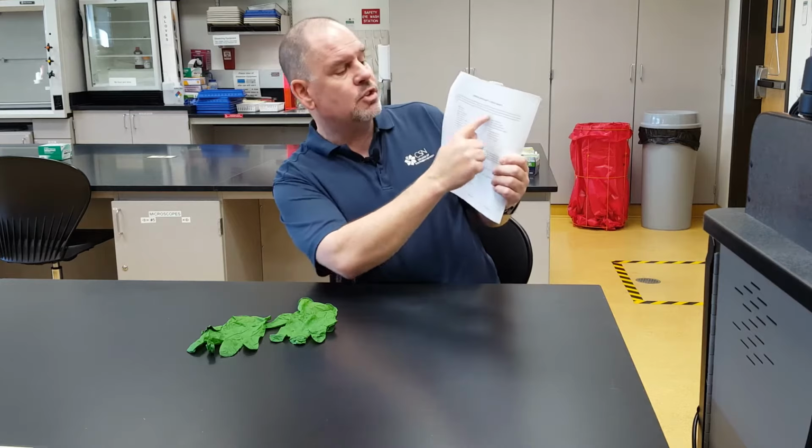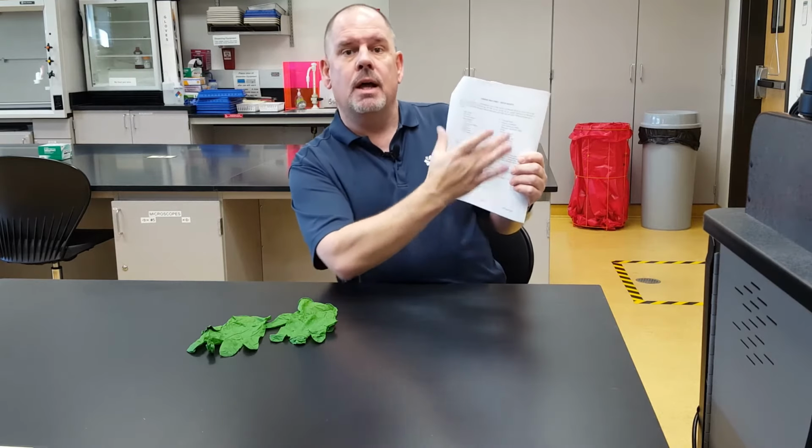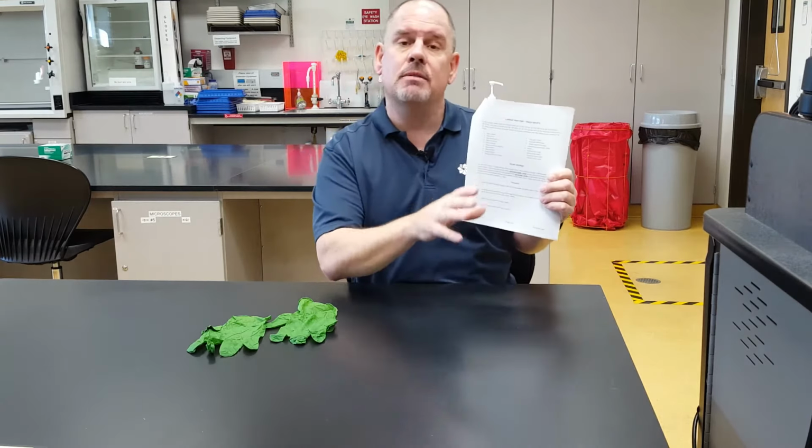Now keep in mind that only these structures right here on page 7 am I allowed to ask you from a sheep heart dissection. So many of the structures that you are responsible for on lab models, because they're designed, handcrafted, painted, are much easier to distinguish than on an actual sheep heart. So I'm limited only to this small list. Remember that as you watch me do the sheep heart dissection.